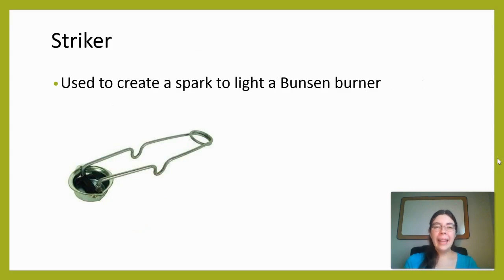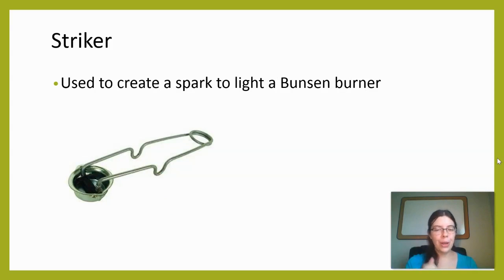In order to light the Bunsen burner, one thing we can use is something called a striker. Basically, you squeeze the two metal wire pieces together and that creates a spark, which we then use to light the Bunsen burner.